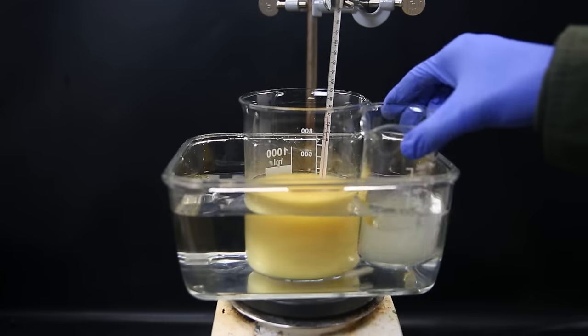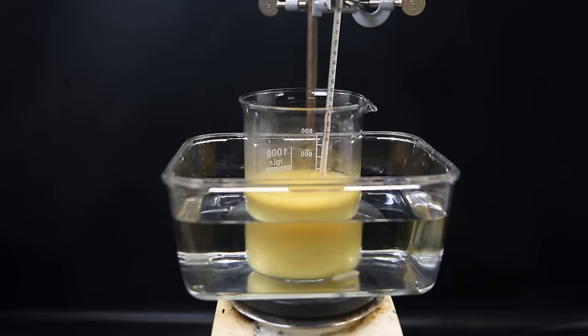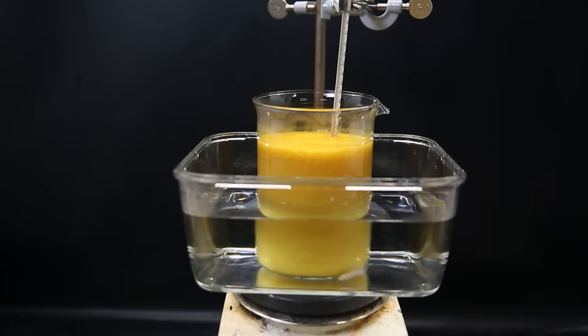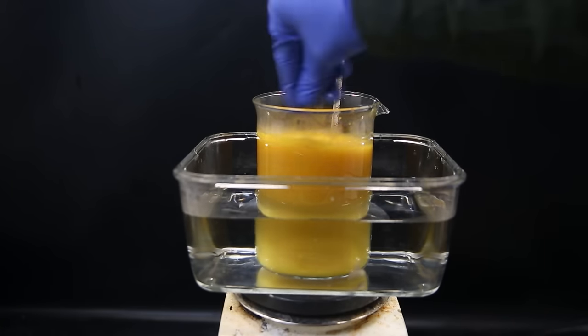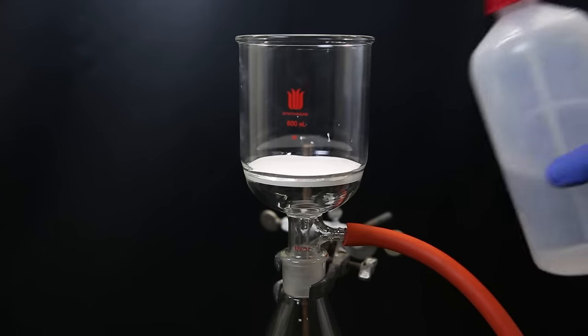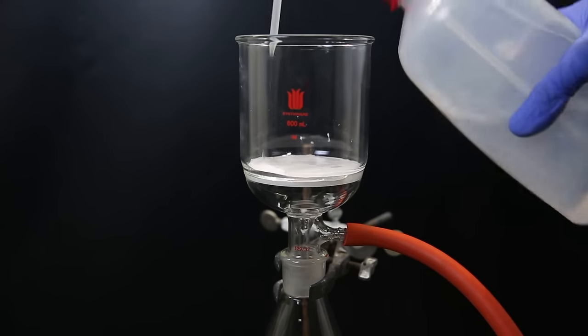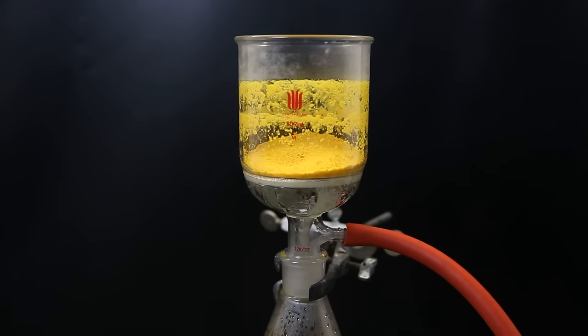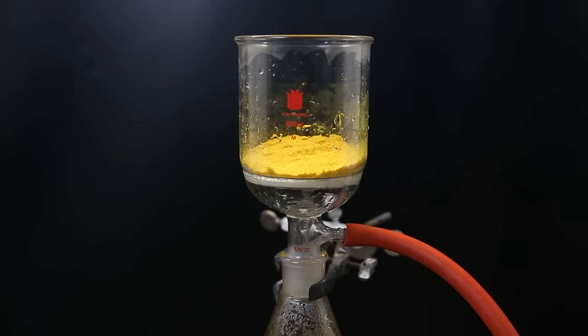I set it in a cold water bath, but the temperature increased too much, and I kept adding the sodium hydroxide solution. After a while, the mixture is alkaline, and a bunch of solid has precipitated out. I then set up a glass filter with a paper filter on top, and wet the filter paper with some water. I then start pulling a vacuum, and filter all of the mixture through. I wash the residue with some more water, and the product is left behind as a bright orange-yellow solid.